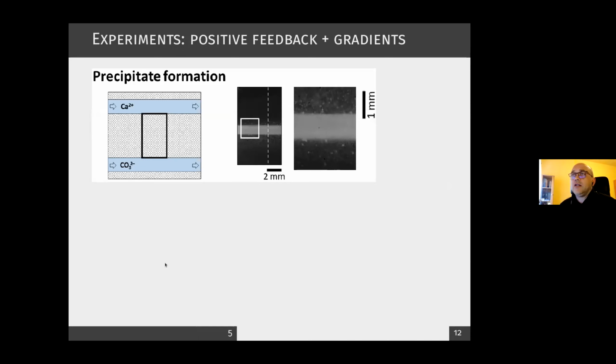At first, we decided to test our device to see if it can operate in the way that we want, so we can reproduce some previous experimental observations. So we applied known chemical reactions which are known to produce some interesting patterns and tested them in this new device. This is a picture of a precipitating reaction.